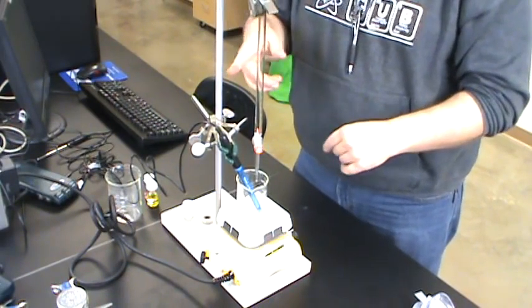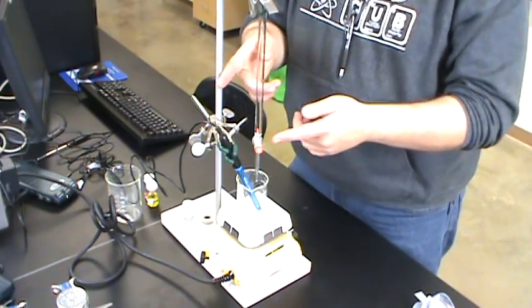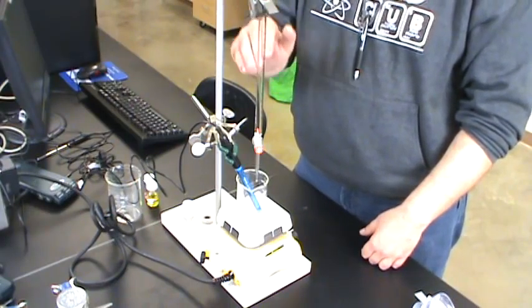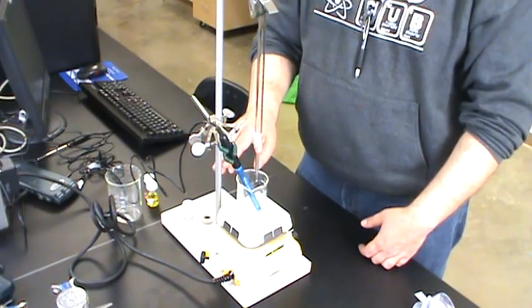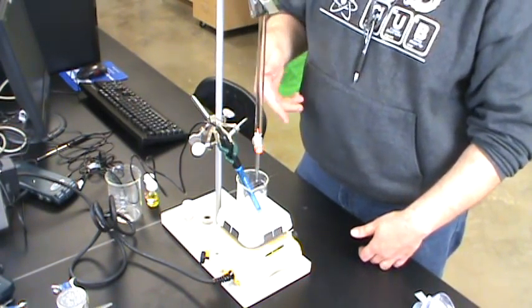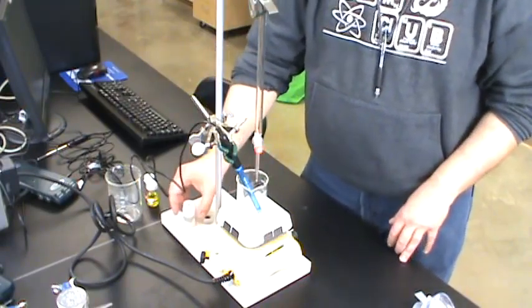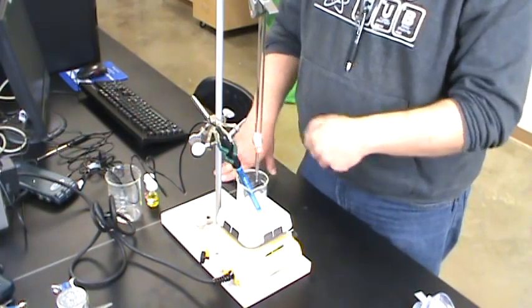This is also another reason why I always nag you to mount that burette clamp up high on the stand — it's so high you can't even see it here. Now you've got all this space on the ring stand to mount other clamps and things. Give that pH probe just a little tilt and you'll have a much easier time getting everything lined up.